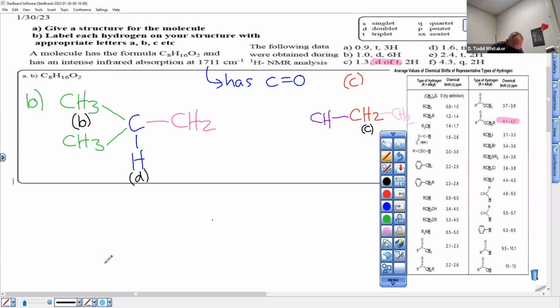Light blue. We're talking about F. We're thinking strongly it's an O attached to a CH2 for F that has 3 neighbors, so some kind of CH3. And make sure you make it an ester or else you don't have the right shift. We got that going on. Very lame carbonyl there. And then I ask myself, that CH3 I drew is a dead end. I better have something that fits it, right? Does A fit it? I think A fits perfectly, right? You can label it A.